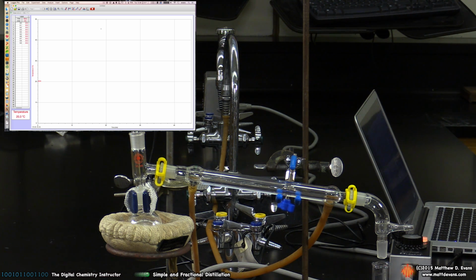At this point, we're just going to have to wait. We have to be patient. The temperature is not going to show any climbing until the moment the distillate starts coming out of the tube. So I've got a couple of different camera angles, and I've got to be watching this experiment. Like I mentioned before, at the 4 milliliter mark of the graduated cylinder, I'm going to have to take my little auto sampler collections, and so we'll do that when the time comes.